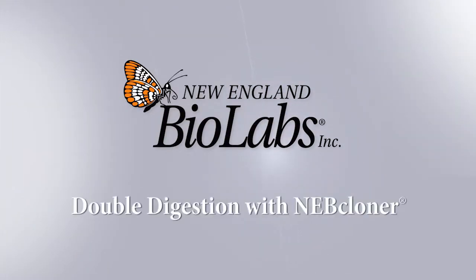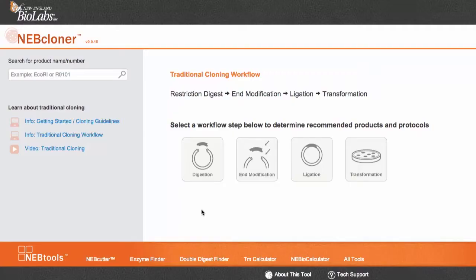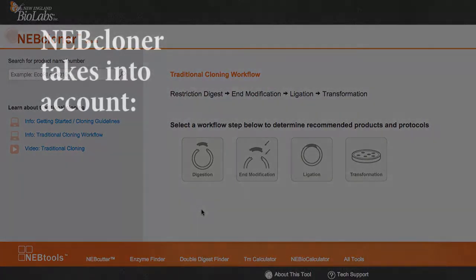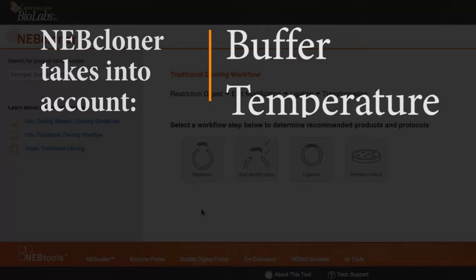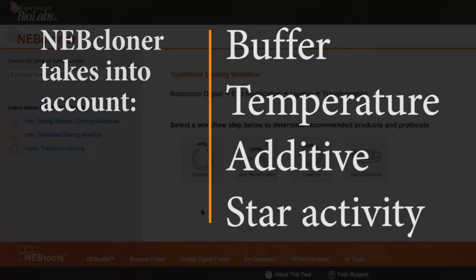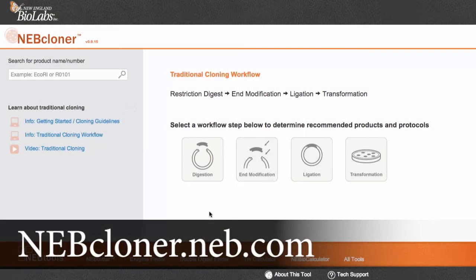In this video, you will learn how double digests are made even easier with the tool NEB Cloner. NEB Cloner provides a nice protocol, taking into account buffer, temperature, additive, as well as star activity differences. Let's see how.